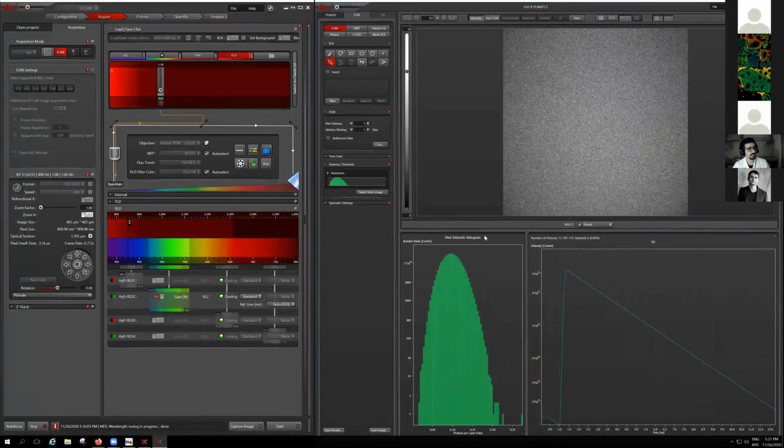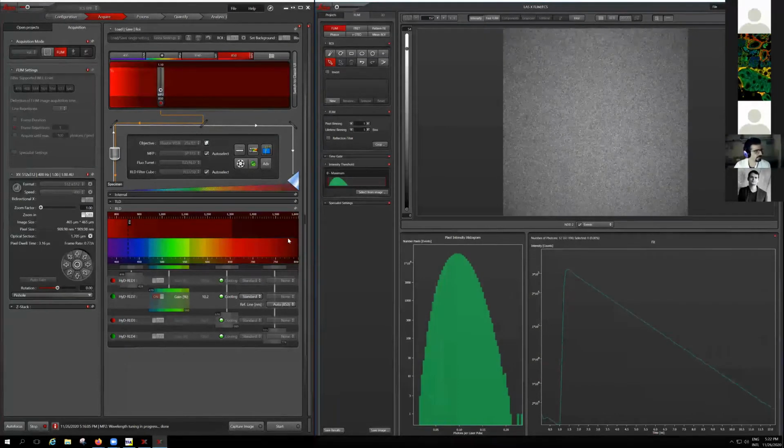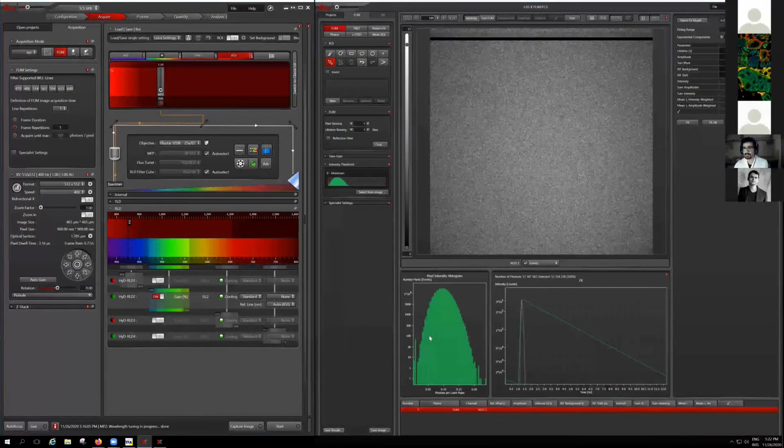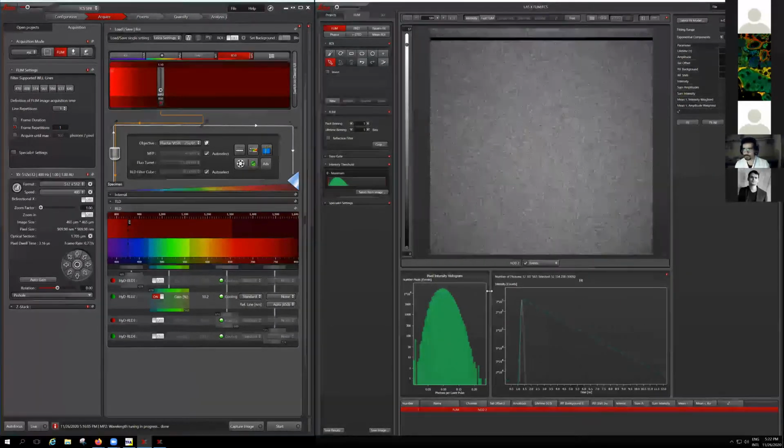Anyhow, I was not able to show you what is really the limit of that. This stops at 1. There is a red line at 1, and it's telling you maximum 1 photon per pulse.